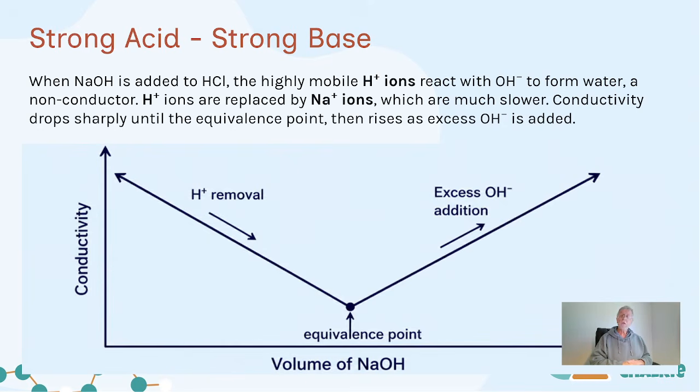So we now start adding the sodium hydroxide from the burette. When you do that, the hydroxide ions from the sodium hydroxide will react with the hydrogen ions from the hydrochloric acid and turn into water. Now water will not conduct. I know that you've got to be careful if you are near any electricity and you're standing in water or bathing or whatever, because it will conduct enough to kill you, but unfortunately it doesn't conduct enough to show in an experiment like this.